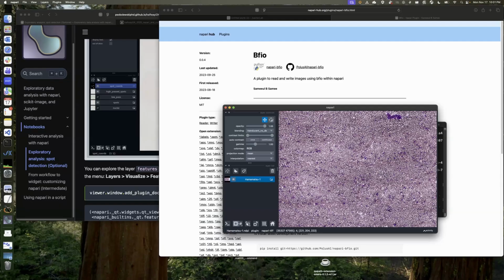The problem is that Napari downsamples to fit into that texture limit rather than showing you just a piece of the image in high resolution. That's a limitation we're still working on. So if you have large 3D images that are more than say 5,000 pixels a side, then the performance isn't great. But I suspect that most viewers will have performance issues with that.